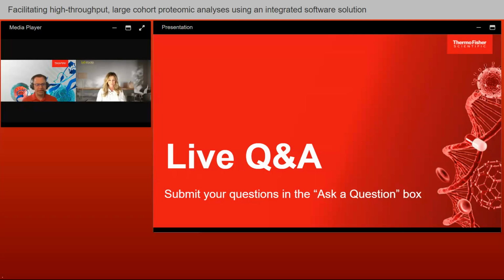Thanks for the question. I actually had a slide that showed the full history of the Proteome Discoverer software that goes way back 15 years that talks about each of the major features. Fortunately, I removed it, but I'll talk through it as best I can. So maybe the way to discuss this is just the history of the timeline of our collaboration with MSAID and getting these AI-based tools into Proteome Discoverer.